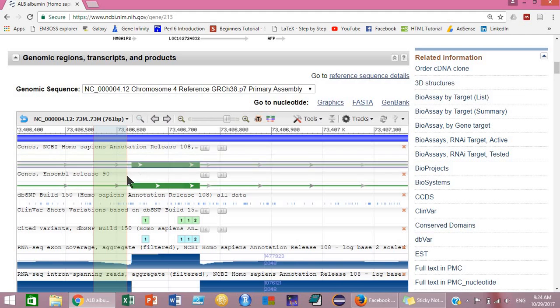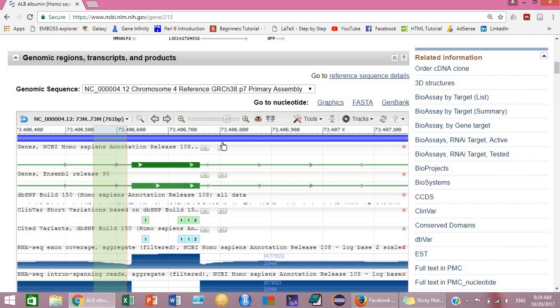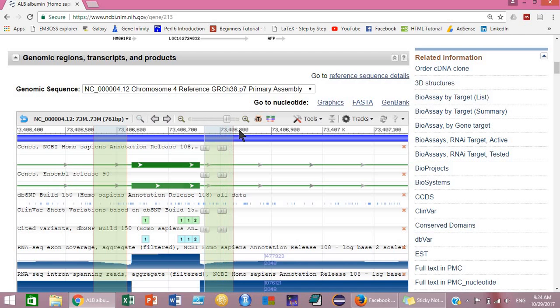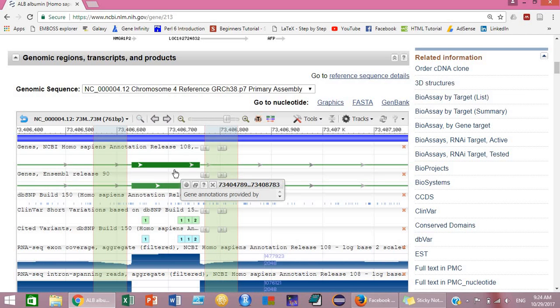For selecting area for the reverse primer, first you will have to click on the Control button and then click on the left mouse button and drag. So this is the area for reverse primers.